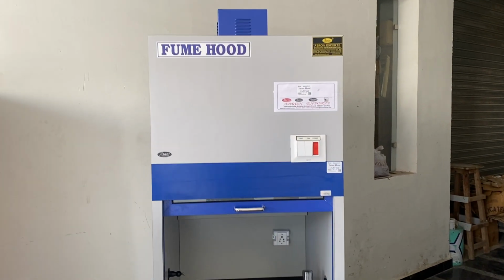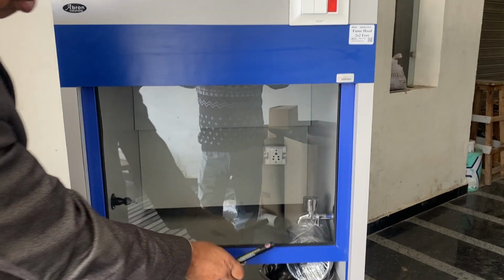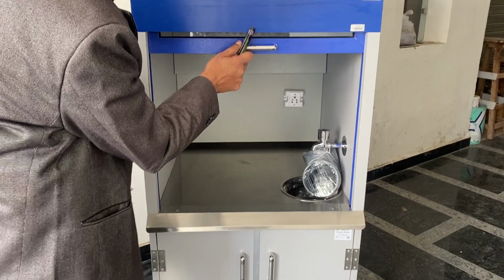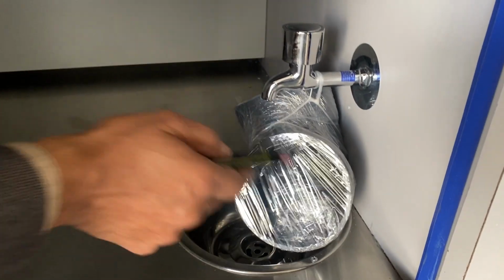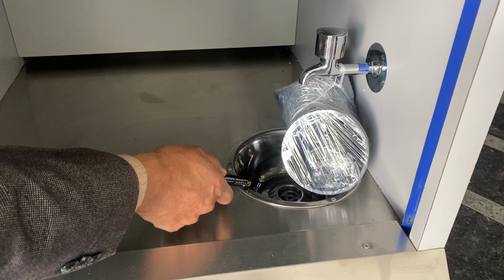This is the Abron Fume Hood, which has one window where the weights are inside, and this one is a window for using. This one table is stainless steel. It has one tap, and this one is only a fume which is to be put outside. Wire is also inside. One wash basin is there.